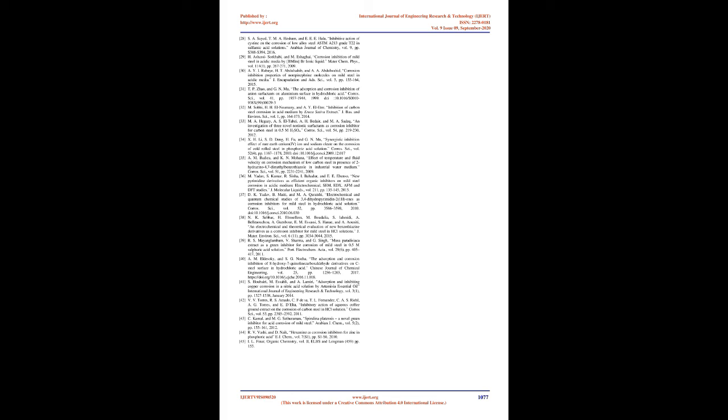From the comparison of Fig 6a, b, c, and the results obtained above, it is clear that a protective film has been formed by the inhibitory molecules on the surface of the MS, which leads to a significant inhibition of the corrosion of MS in 0.5 M acetic acid. The 4 nitrogen atoms of hexamine, having high electron density, must have functioned as the reaction center. The inhibition action can be accounted for by the interaction of lone pair of electrons at the nitrogen atom with the positively charged metal surface 44.